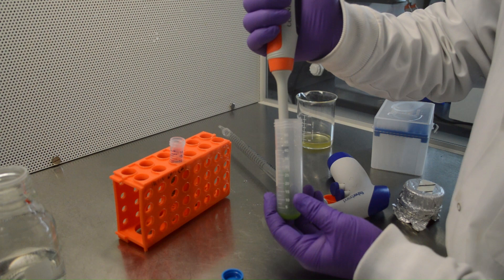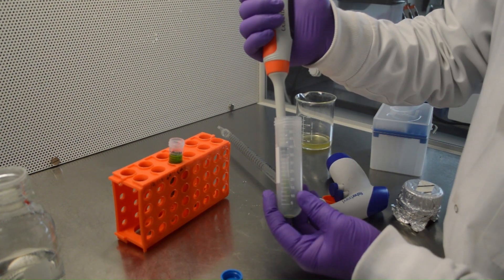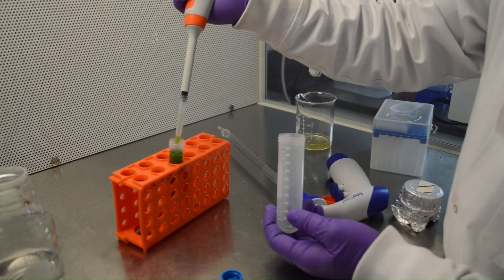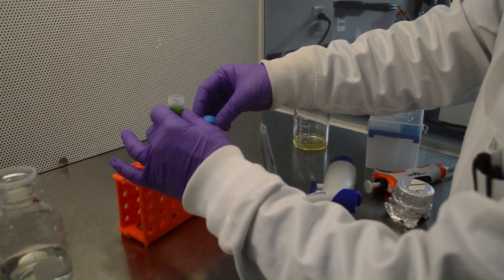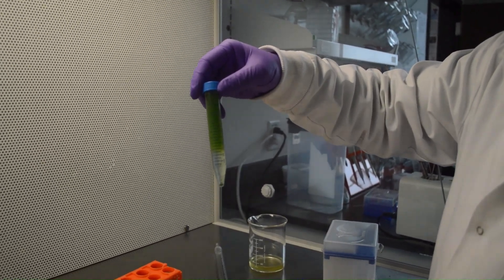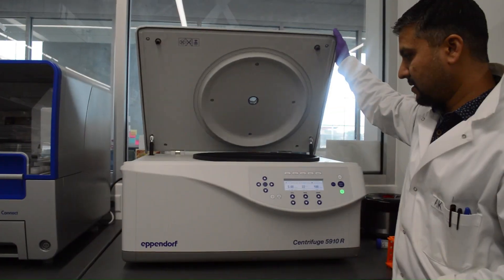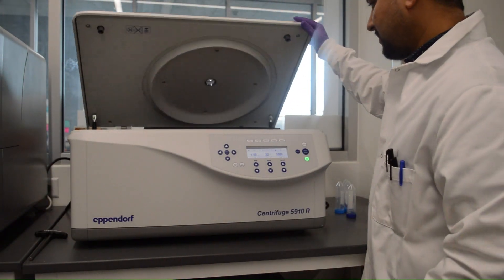Transfer the protoplast suspension on top of 8 milliliters of 0.55 molar sucrose in a 15-milliliter falcon tube. Centrifuge the tube at 1,000 RCF for 5 minutes at room temperature.